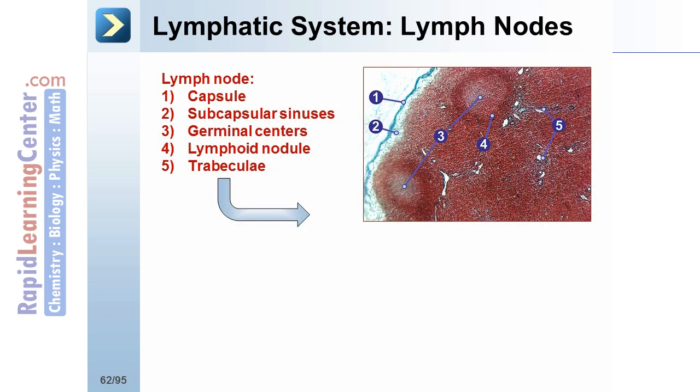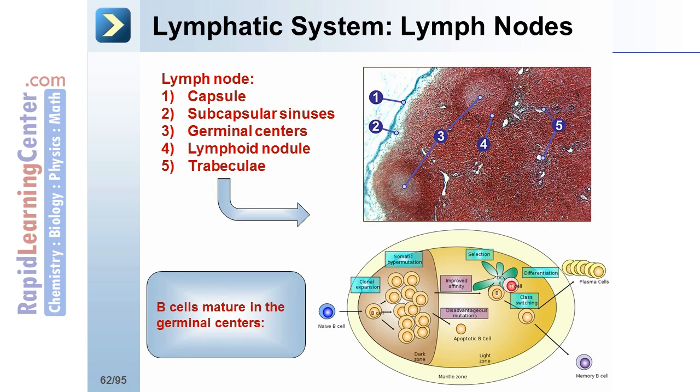To visualize connective tissue, a combination of 3 stains is used to visualize the nucleus, cytoplasm, and matrix. Examples of commonly used stains are Masson's trichrome or Mallory's triple CT stain, which will stain the nucleus dark red or purple, the cytoplasm pink, and connective tissue blue.